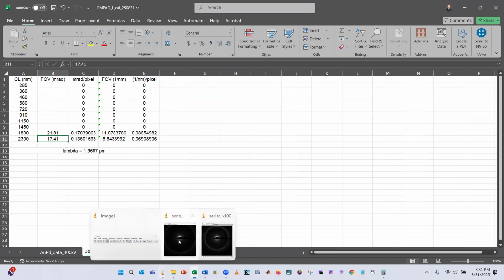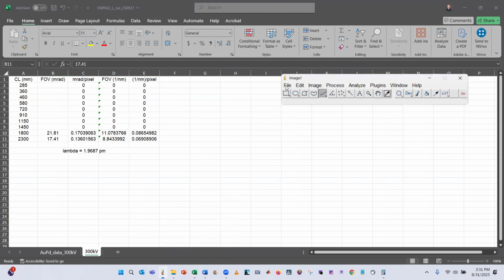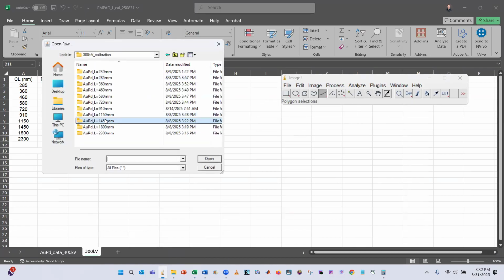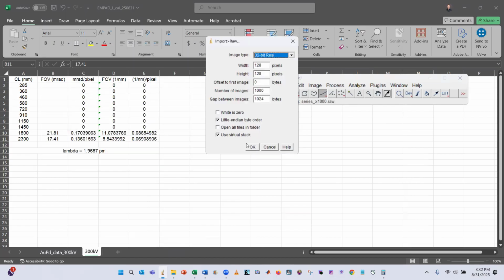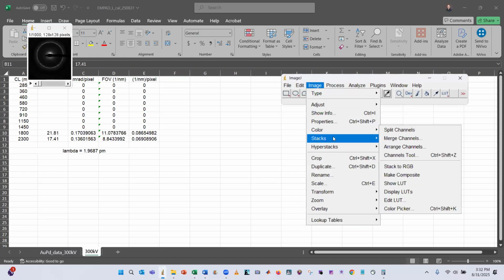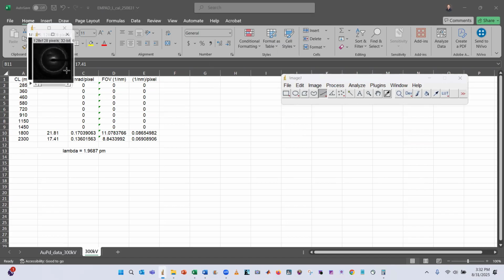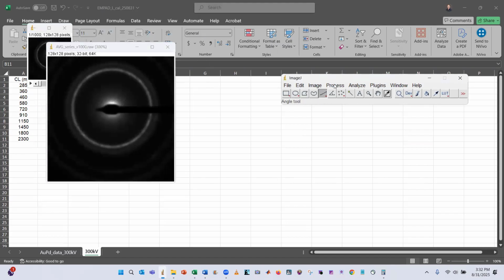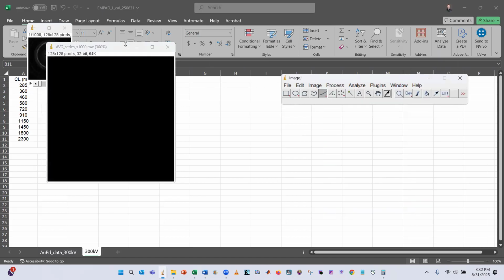Let's see here. Let's close that one and that one. Okay. Math log.